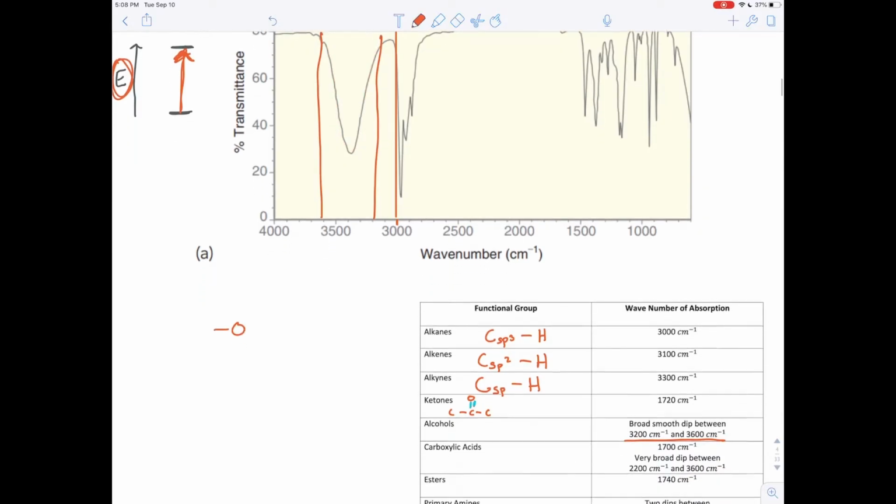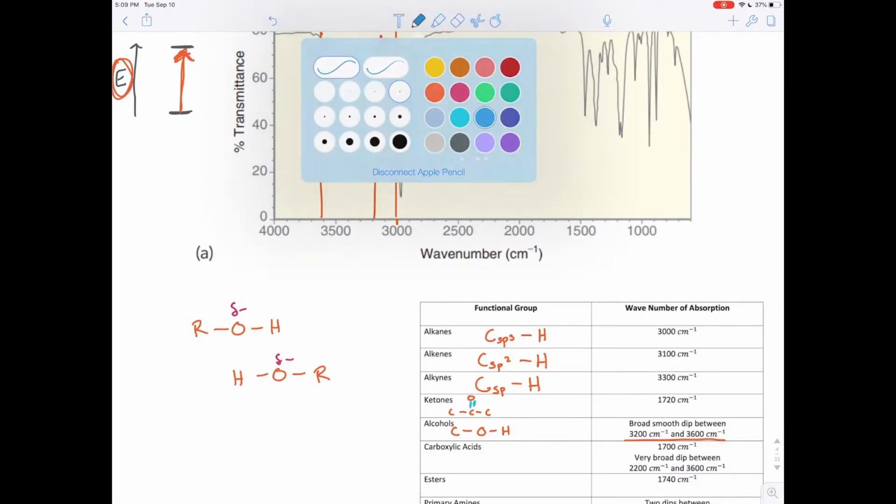So if you have an alcohol, and recall that an alcohol is when you have an oxygen bonded to a hydrogen, and that's on some carbon chain. So if you have 2 alcohols, what can happen? 2 alcohols on different carbon atoms. Remember that capital R is any carbon chain. The oxygens are electronegative and steal electrons for themselves. They become slightly negative.